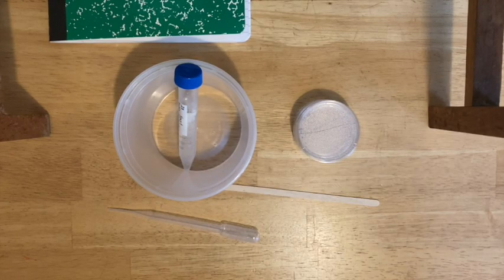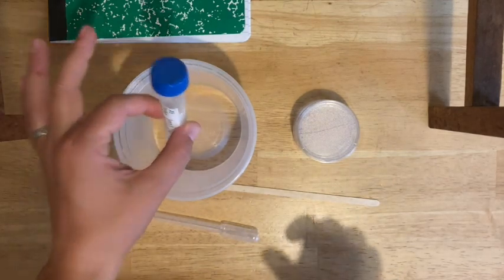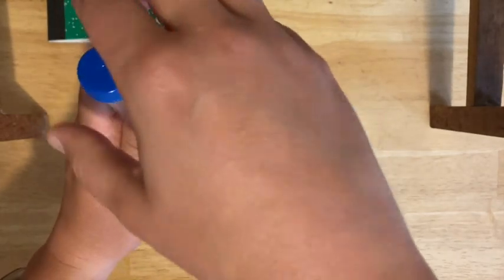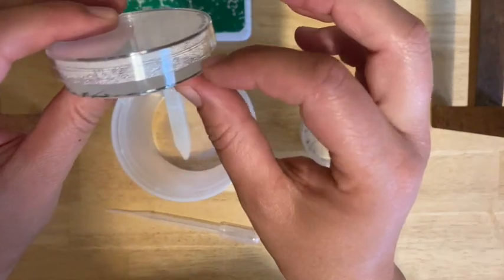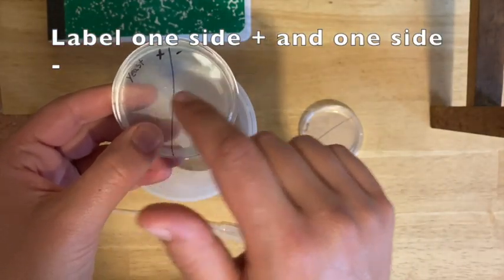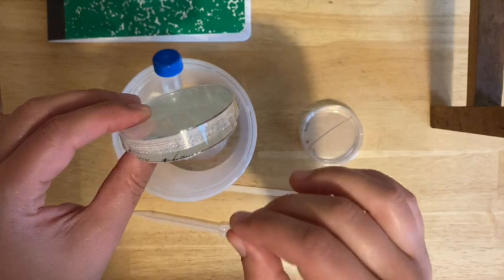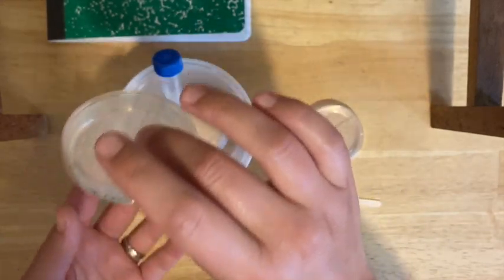Once your plates have cooled, wash your hands again and put on your mask and safety glasses. Screw the cap on the yeast tube tightly and invert a couple of times to mix, then open it back up. You've got your solid agar layer, your plus side where you'll put the yeast, and your minus side as your control — no yeast. Keep the plates closed as much as possible to avoid contamination, and be careful not to touch the inside of the plates.